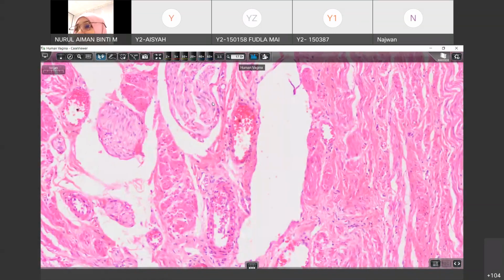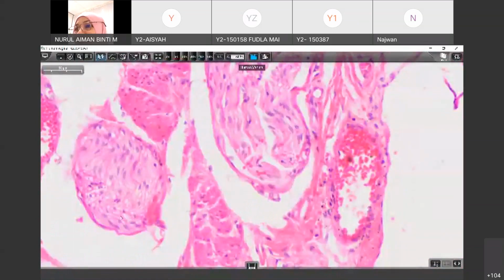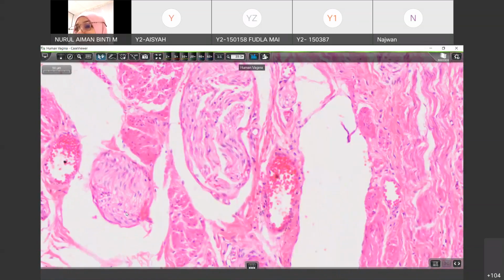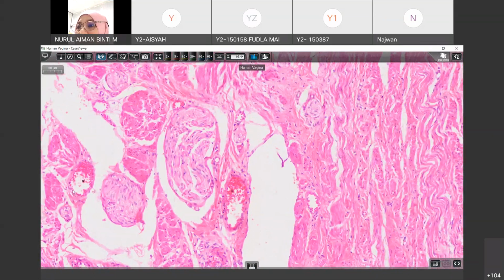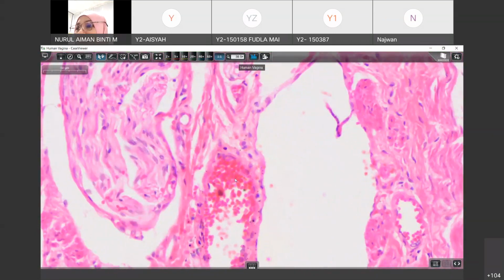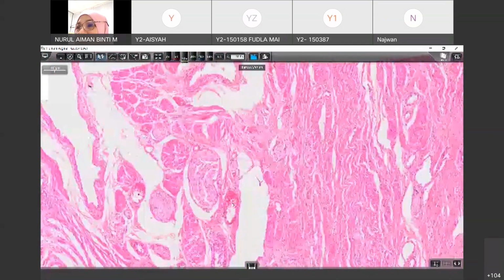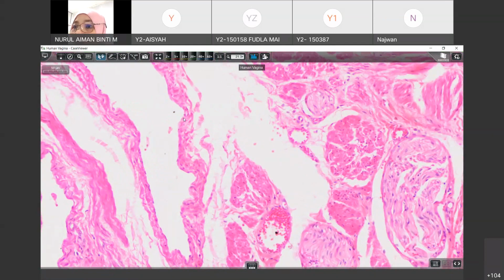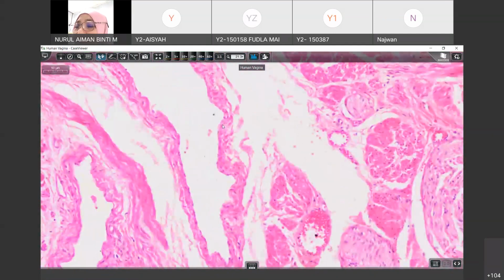So this is part of the nervous tissue, the neuron, that innervates the vagina, and you can see the blood vessels with a lot of red blood cells inside. Of course, this is already a distracted region, and the vagina is not covered by the mesothelium. You will not find any mesothelium, but maybe part of it.